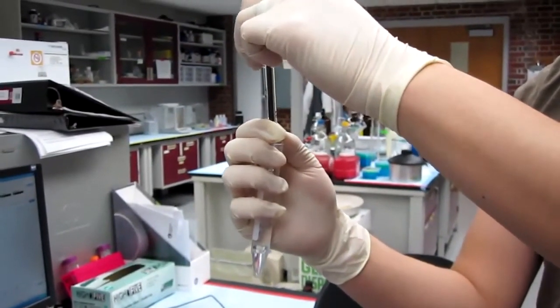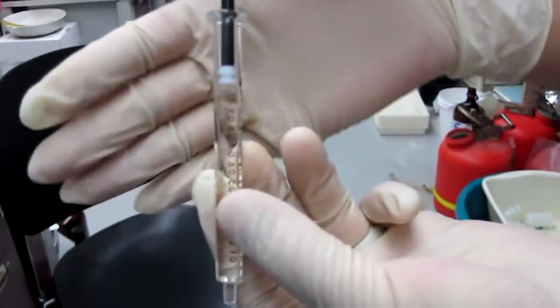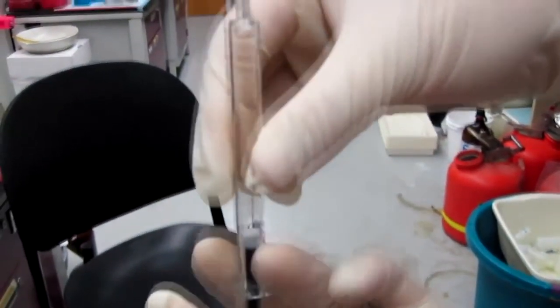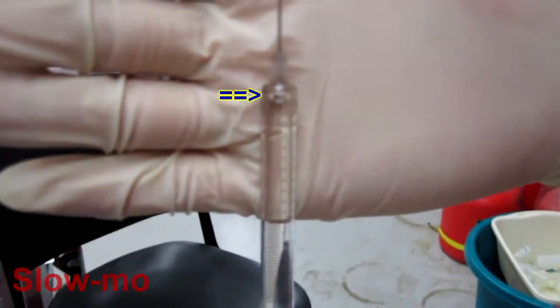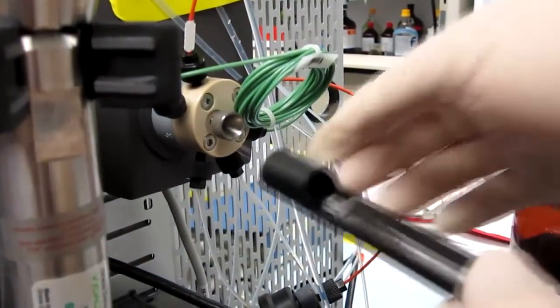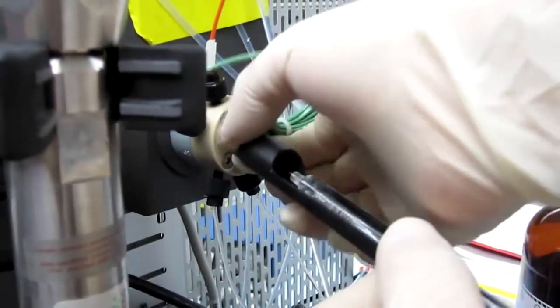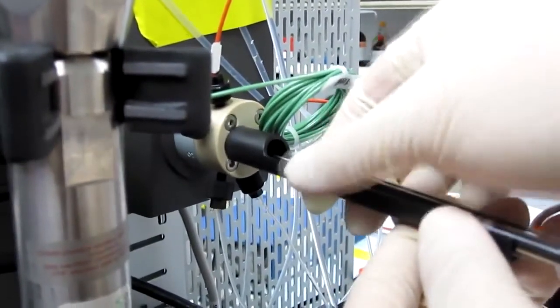For this example, we used a 1 ml sample loop, and therefore a 1 ml syringe. If there are air bubbles in the syringe, we must flip the syringe and squeeze the bubbles out in order to prevent gas from entering the column. Let's see that in slow motion. We can now replace the syringe back into the instrument. Do not over-tighten the metal screw cap, as the plastic tip on the cap may deform, causing poor injection.